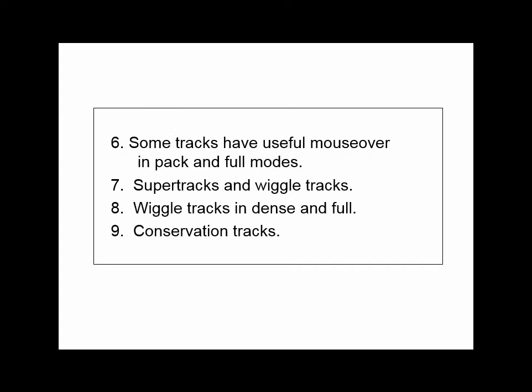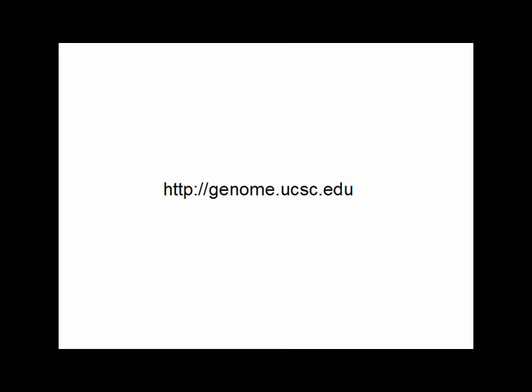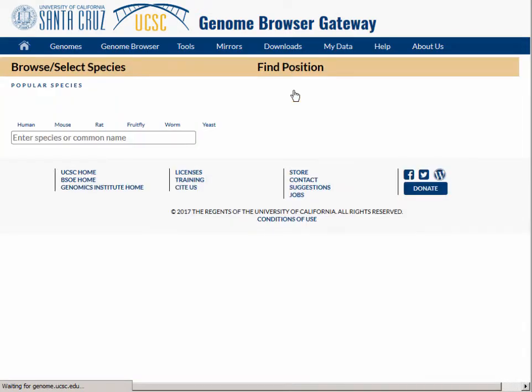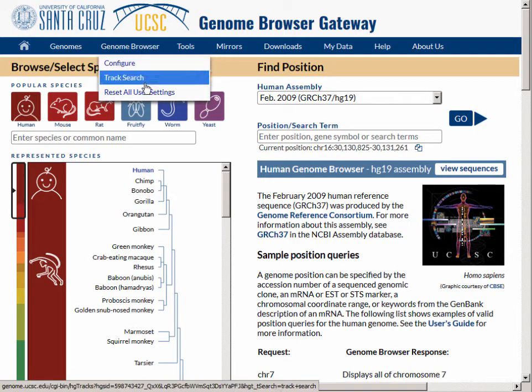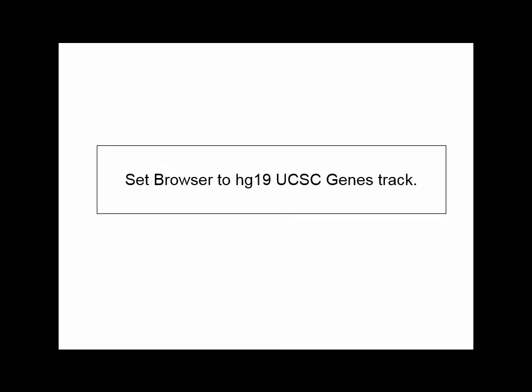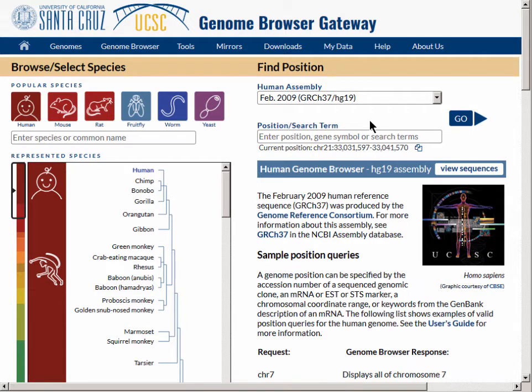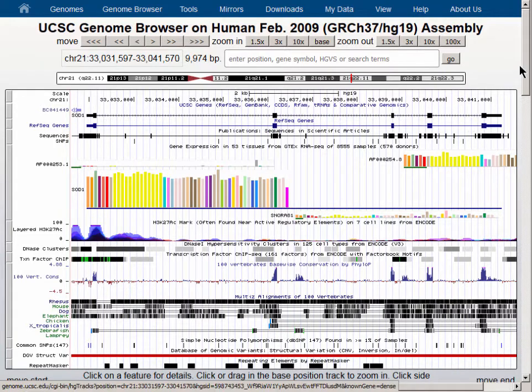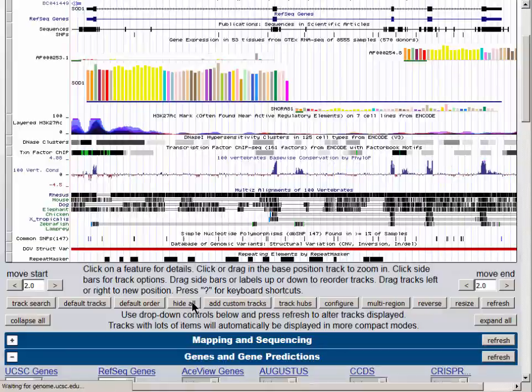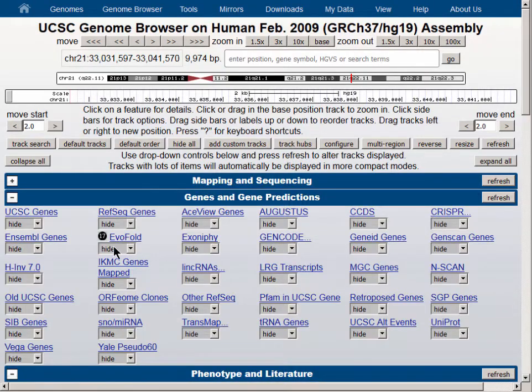We will begin at genome.ucsc.edu and visit the browser using the Genome Browser link. At the resulting gateway page, let's reset all user settings, which gives us the Human Genome Assembly HG38. We will switch to the previous assembly, HG19, and hit the Go button. We start with a large number of tracks of various kinds turned on, so let's hide them all and reset the browser to display just the UCSC Genes track.